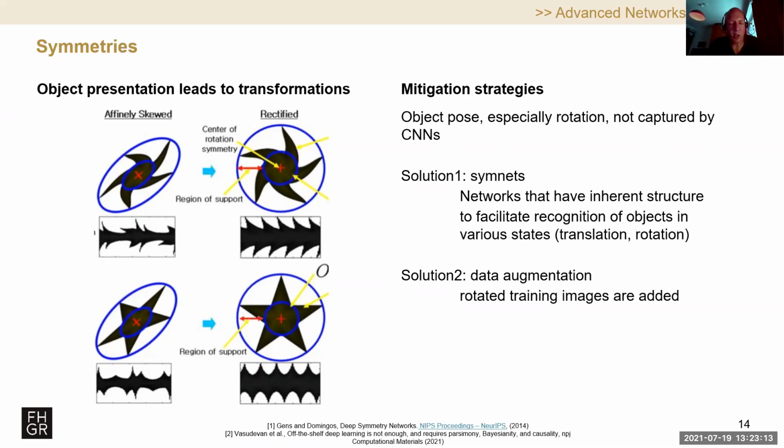And the cells that you use for training your image processing tasks, your deep learning networks, are rotated automatically in all different directions, so that you don't have this bias when you analyze your images. Of course, this is all problematic, right?